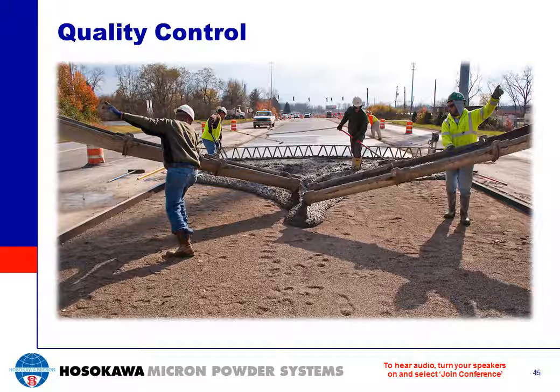Cement companies will perform tests like these to ensure a small particle size. As a rule, which I'm sure many of us know, larger particles pack more poorly than smaller particles. By decreasing the particle size, it creates a higher surface area and the packing density is improved. Cement companies want a smaller particle when laying cement. Increasing the surface area and the packing density can eliminate any air pockets that can create a significant product flaw.